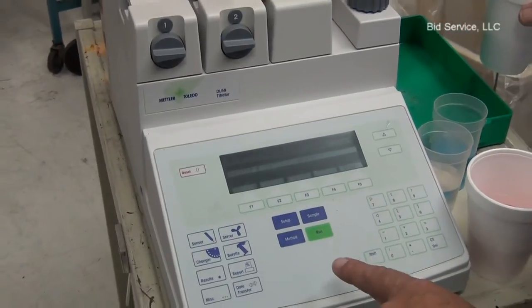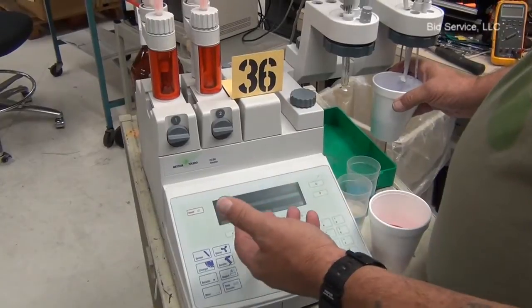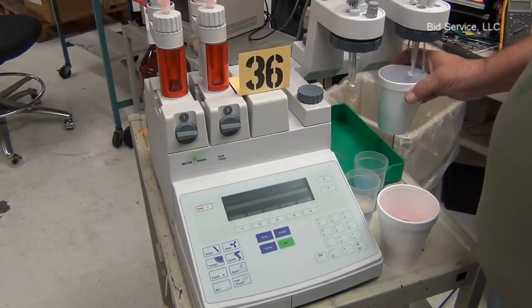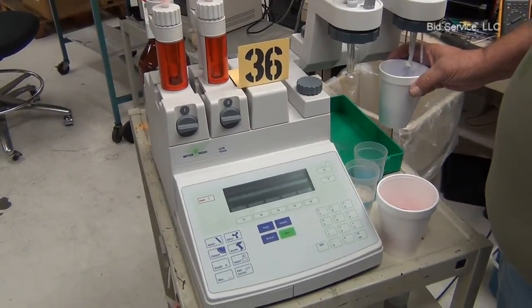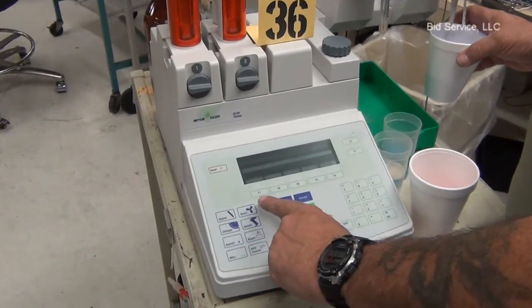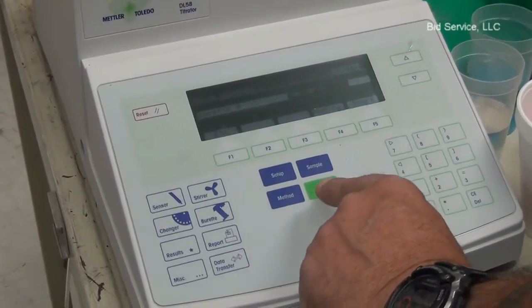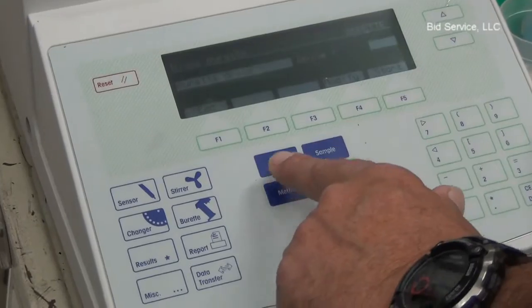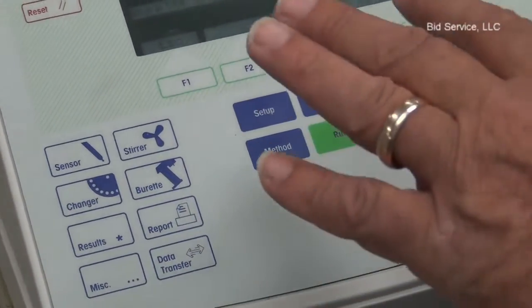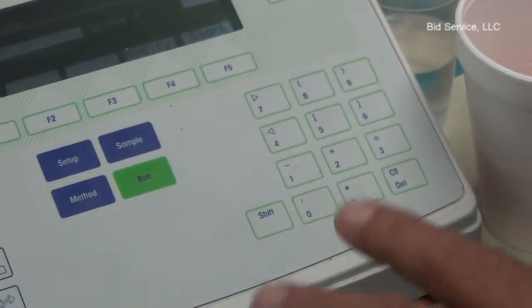This is all totally programmable. You can set it to however many cycles you want — so if you wanted 50 mils you could set it to do that, and it would do that same operation five times to make the 50 mils. As you can see from here, it can operate all of the sensors, the burette, the stirrers — everything independently. It will give you reports, and also your methods, your setup, your samples, your run key — all of that is in here. Methods are stored; all of the original methods from Mettler are stored on here, and there are some user methods that may be helpful that they can use too.